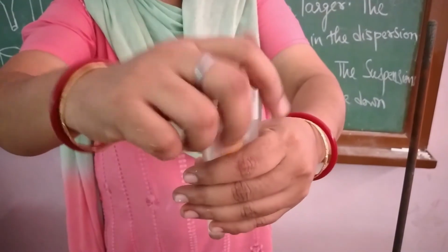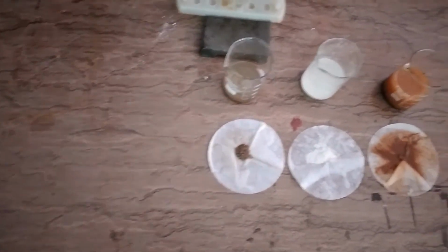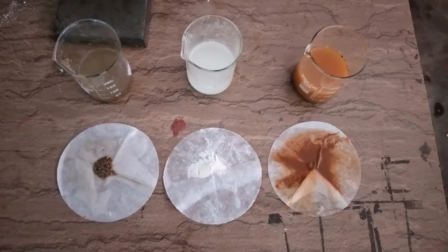So I hope the concept of the experiment is clear. I will stop the experiment now and we will meet in the next experiment. Thank you.